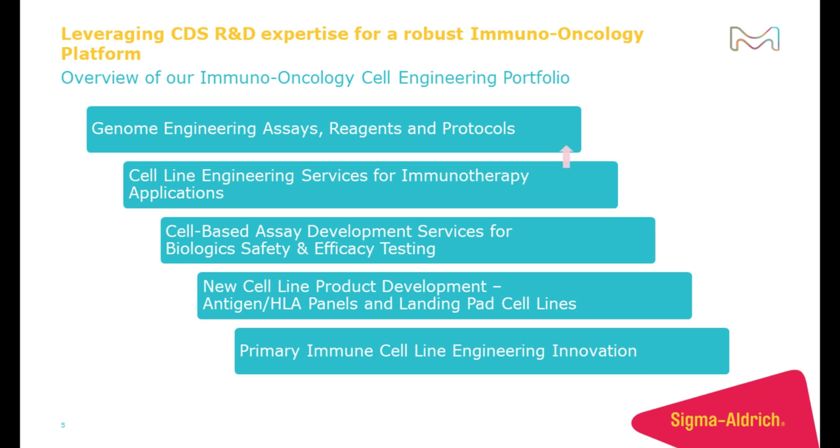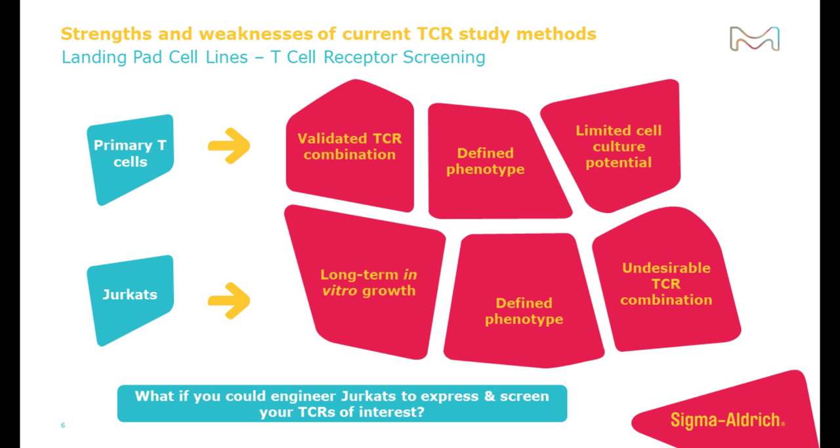The next thing I want to talk about is a couple of cell lines that we have developed, how those are being used to make immunotherapy development and assessment more standardized and more consistent. The first project I want to discuss is the development of what we call our landing pad cell lines. And so as most of you probably know, selection of model systems for studying, for example, TCRs is often a trade-off between the robustness of the system and the relevance of the biology.